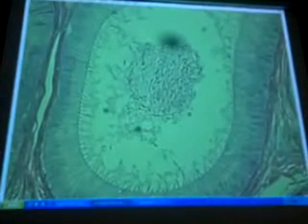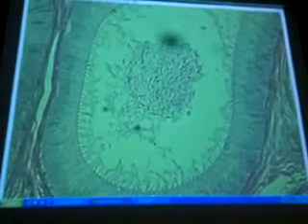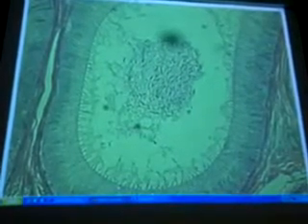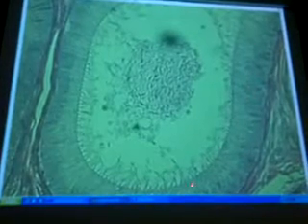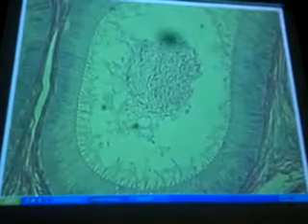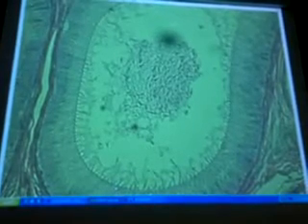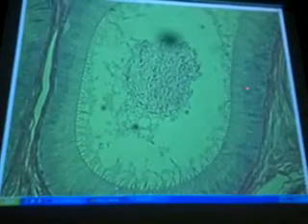Okay. And I'm not big on if you put pseudostratified columnar or just simple columnar. I don't think I deduct points depending. It may look different depending on what slide I grab. But if you put some kind of columnar, I figure you're close enough. I'll just give you credit if I ask you to identify the tissue.